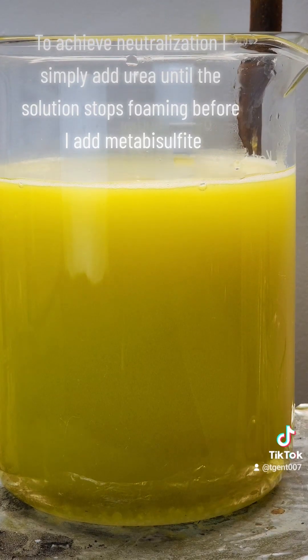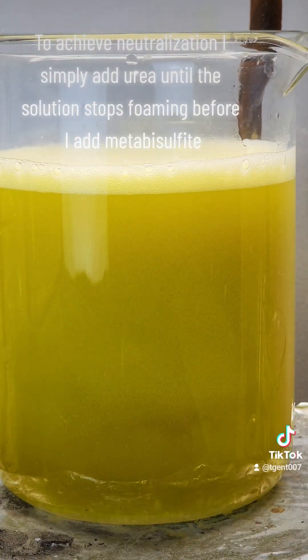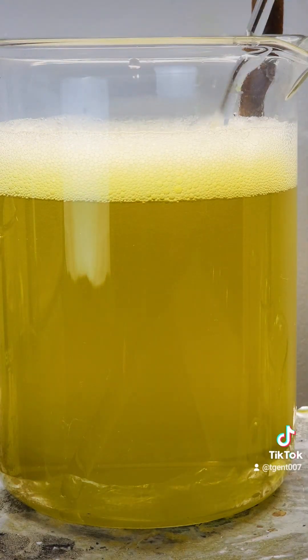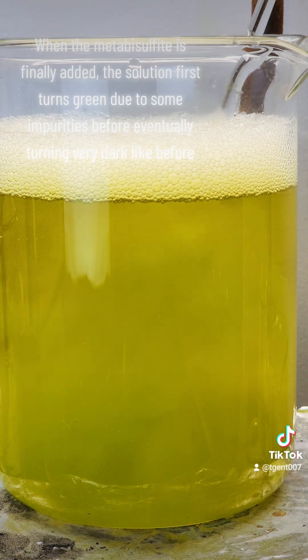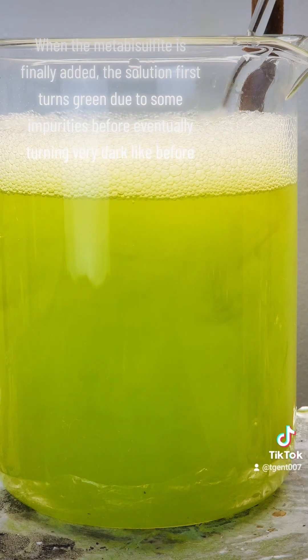To achieve neutralization, I simply add urea until the solution stops foaming before I add metabisulfite. When the metabisulfite is finally added, the solution first turns green due to some impurities before eventually turning very dark like before.